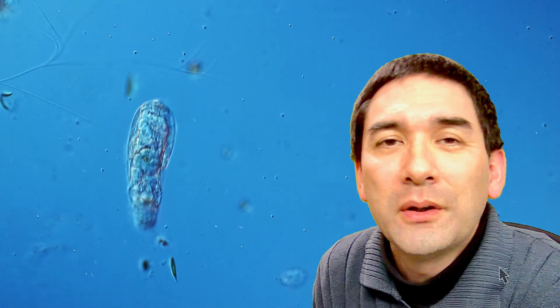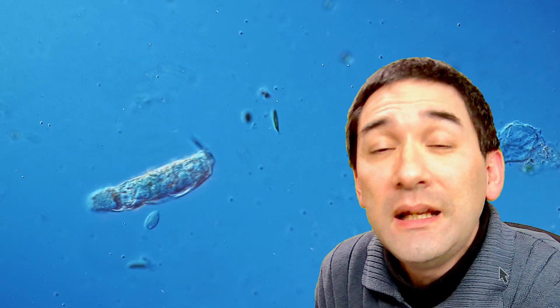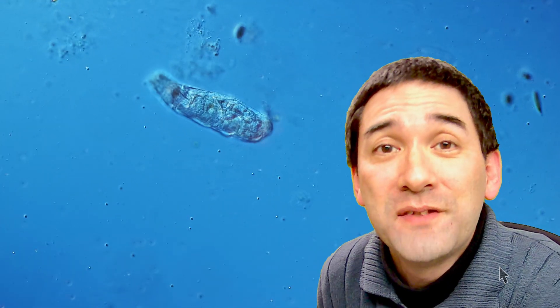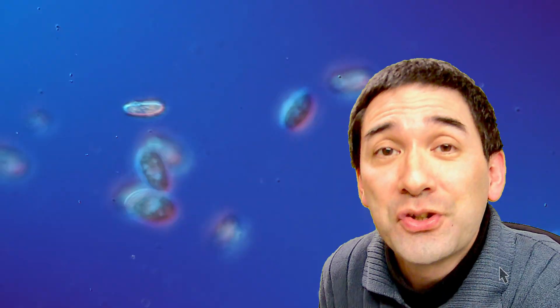Again a rotifer over here. And so these are all the little microorganisms and micro animals that are important in an aquarium to make sure that the aquarium is healthy and balanced. And as we've seen before, some of the plants even though they have those microorganisms on them, it's not enough right. And for this is the reason why there is an aquarium filter.